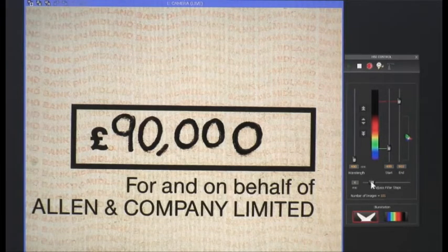Next, we set the wavelength interval between each image using this slider. The range is 1 to 20 nanometer steps. The smaller the step size, the more images are required, as indicated here. As we are allowed to record up to a maximum of 151 images, we could use as little as 3 nanometer steps, but it will be set to 4 nanometers for now.